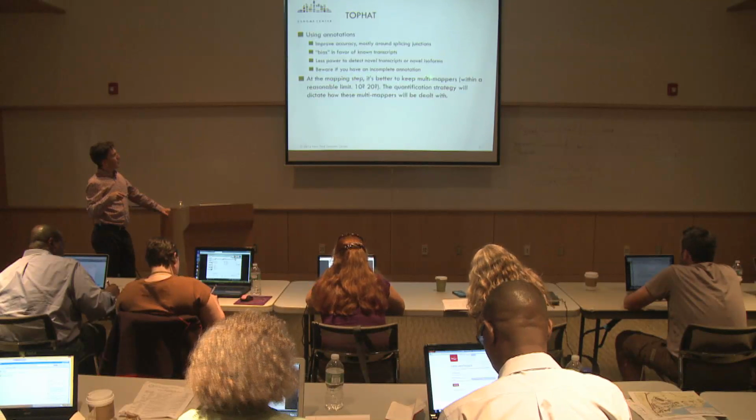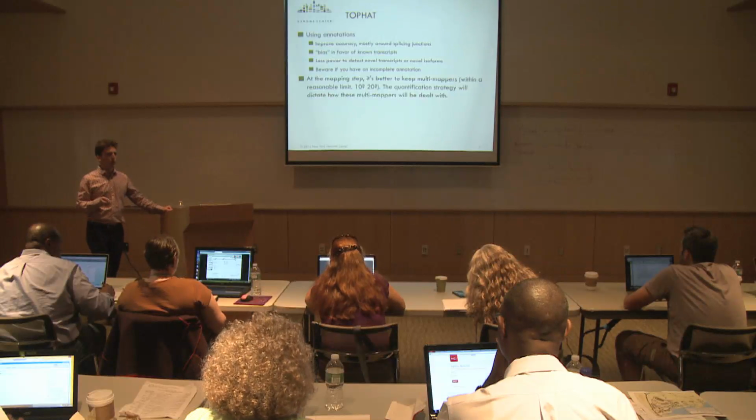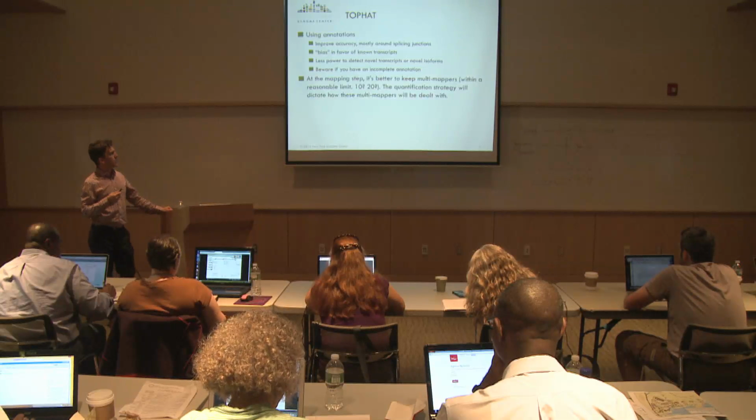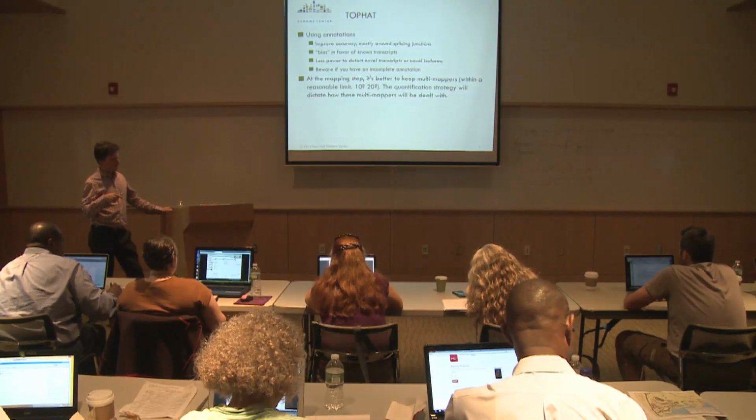The question of multi-mappers. For each read, it comes from one location, but there might be other locations in the genome that match equally well. For exome sequencing or for genome sequencing, we usually don't keep the different locations. For RNA-Seq, we tend to keep the multi-mappers.